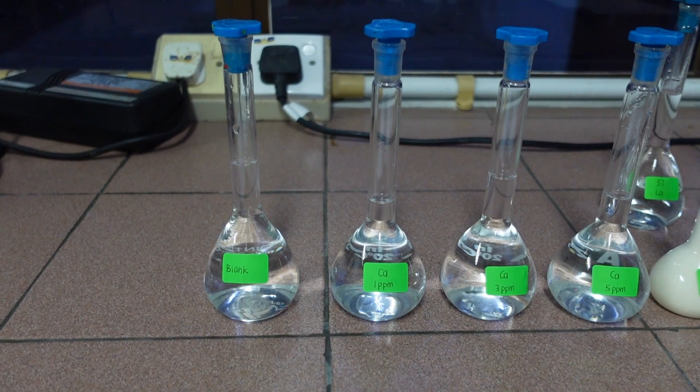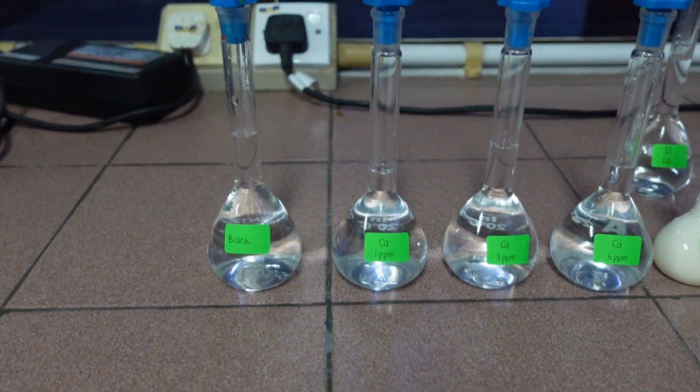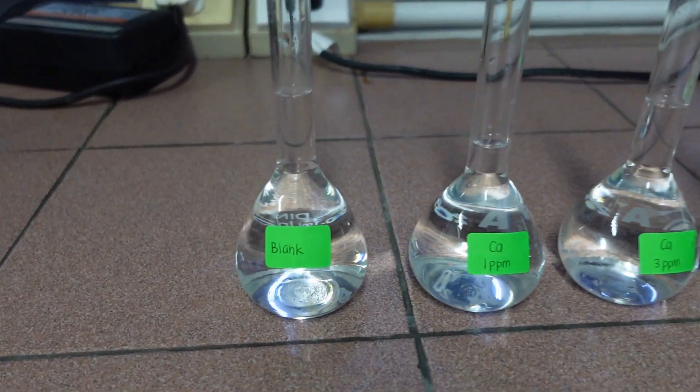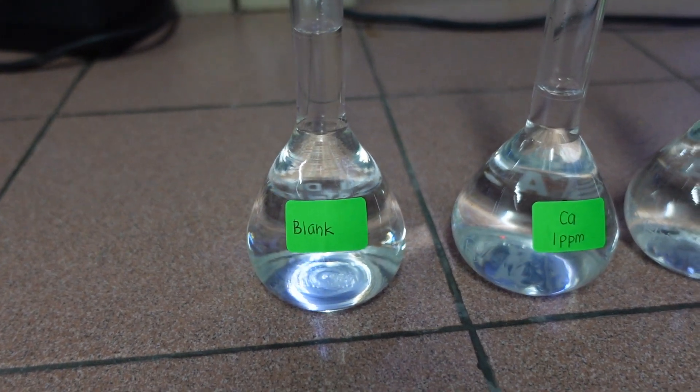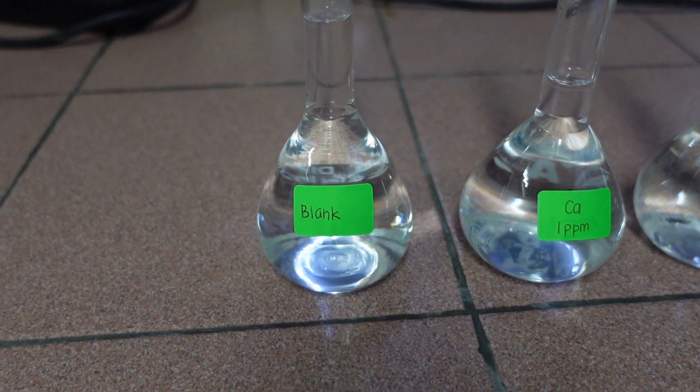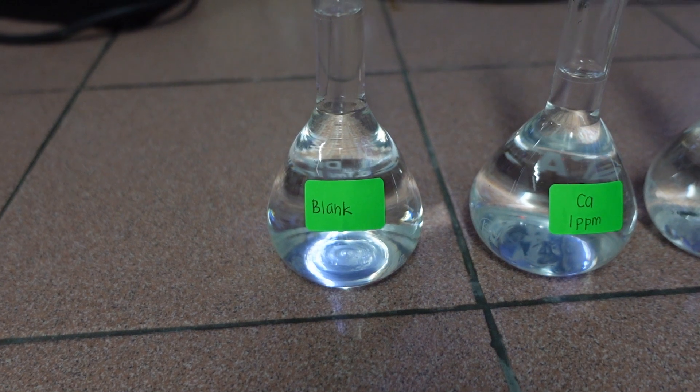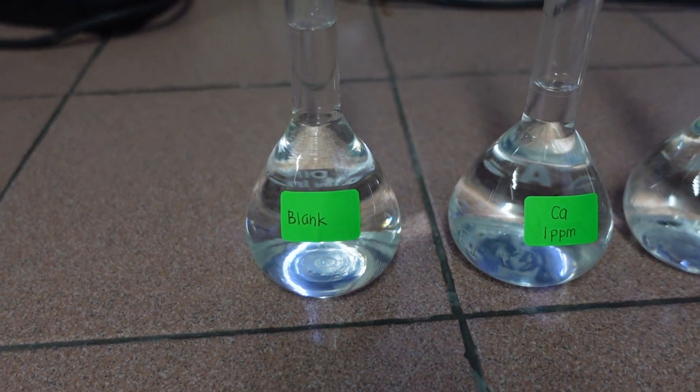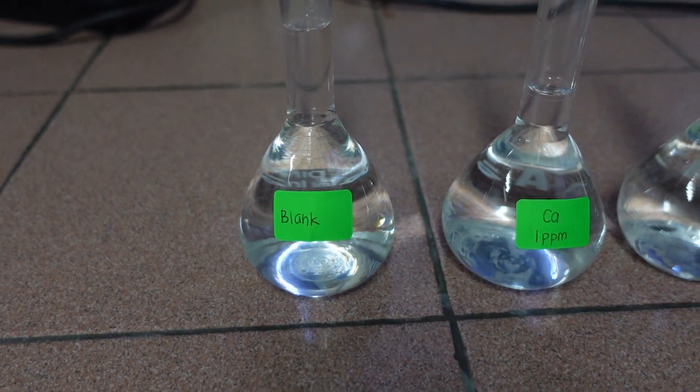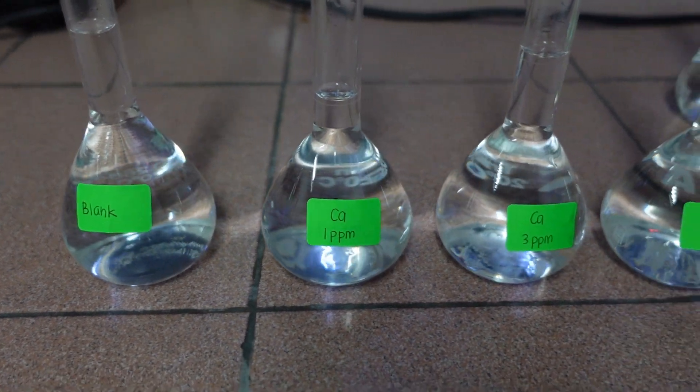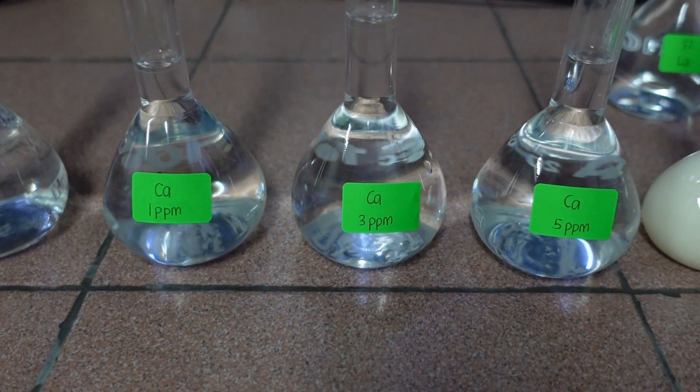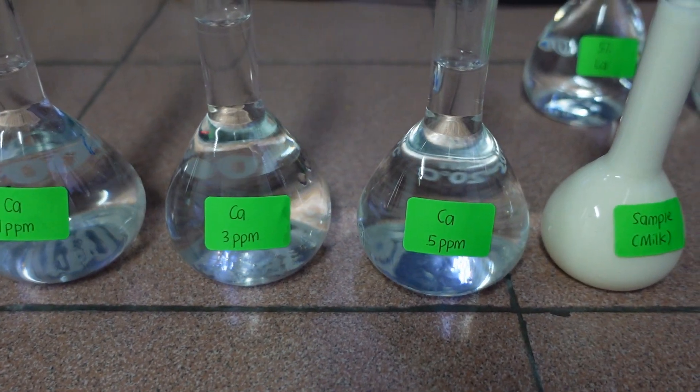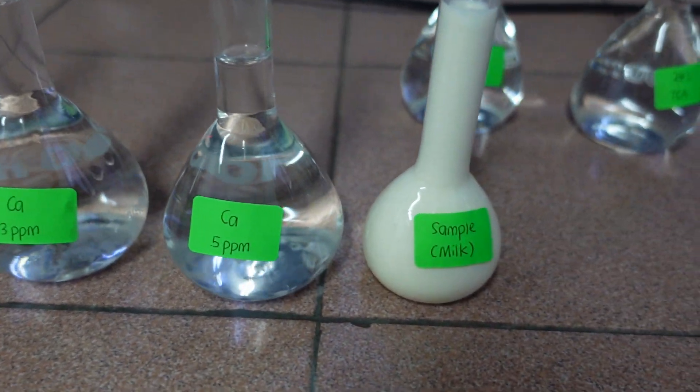As you can see here, these are the standards prepared. We have a blank. Like any analysis, we need to prepare a blank first. Blank is basically the solvent we use in our standard as well as in our sample. This is calcium at 1 ppm, calcium at 3 ppm, and calcium at 5 ppm.